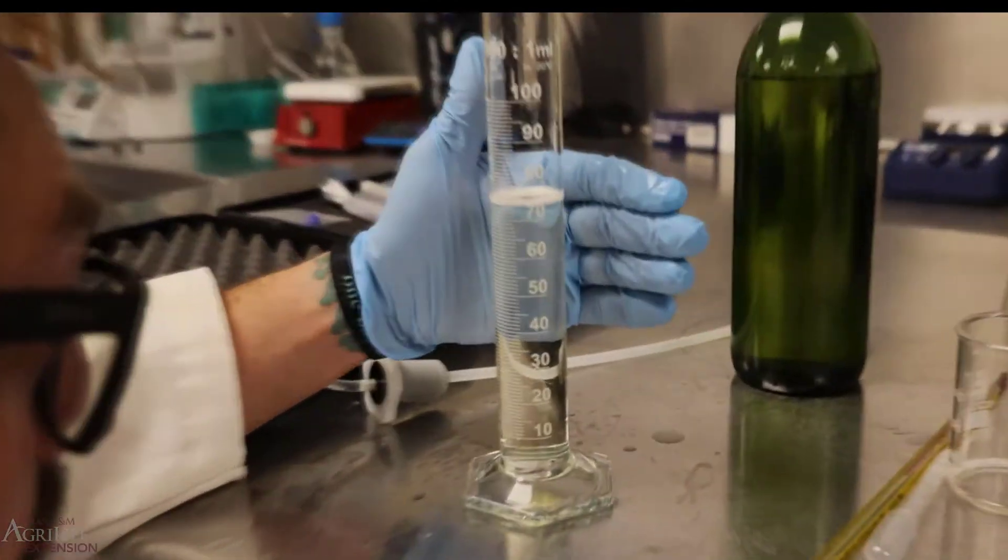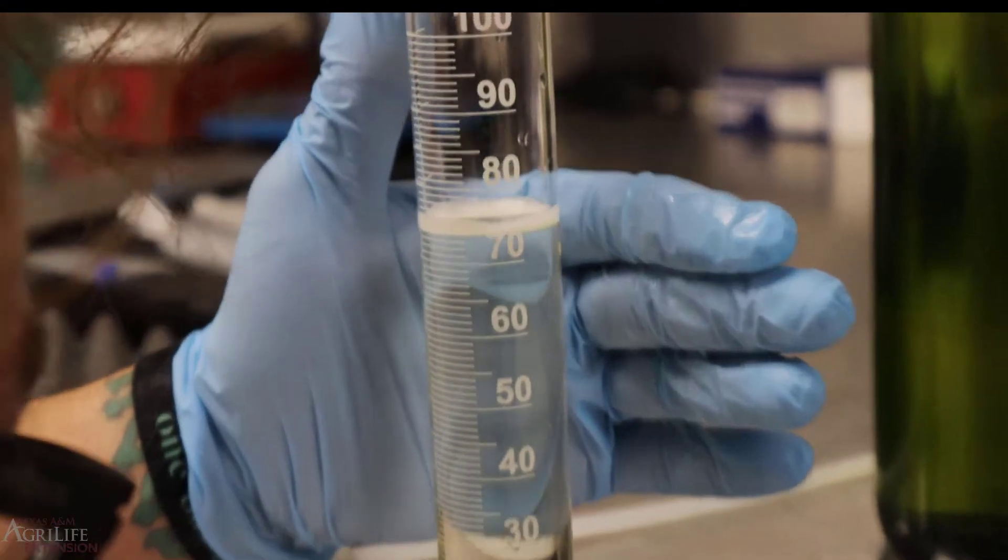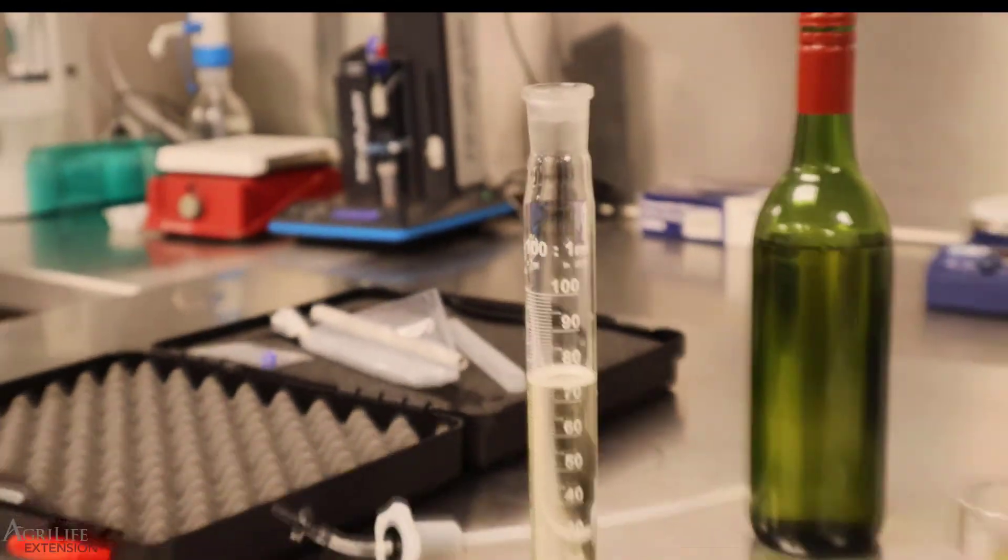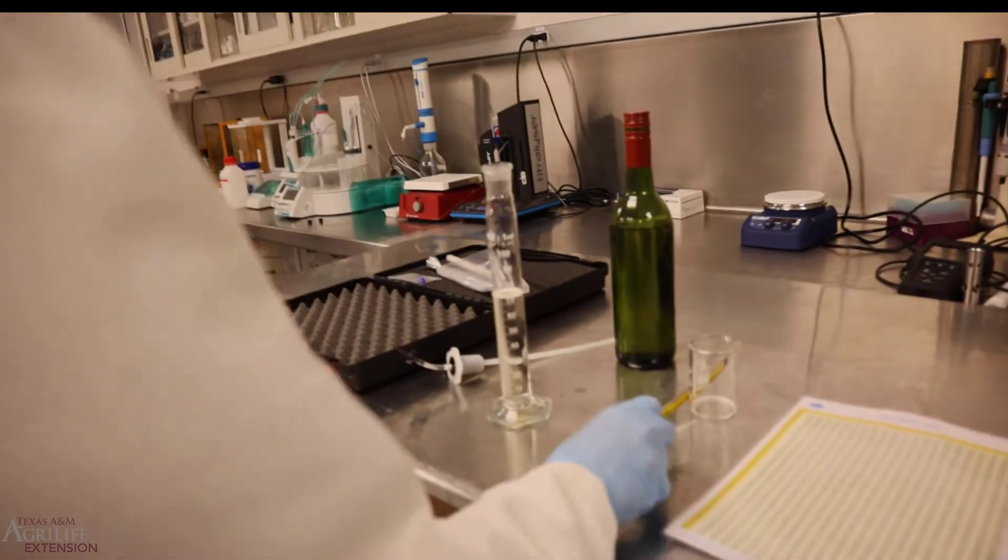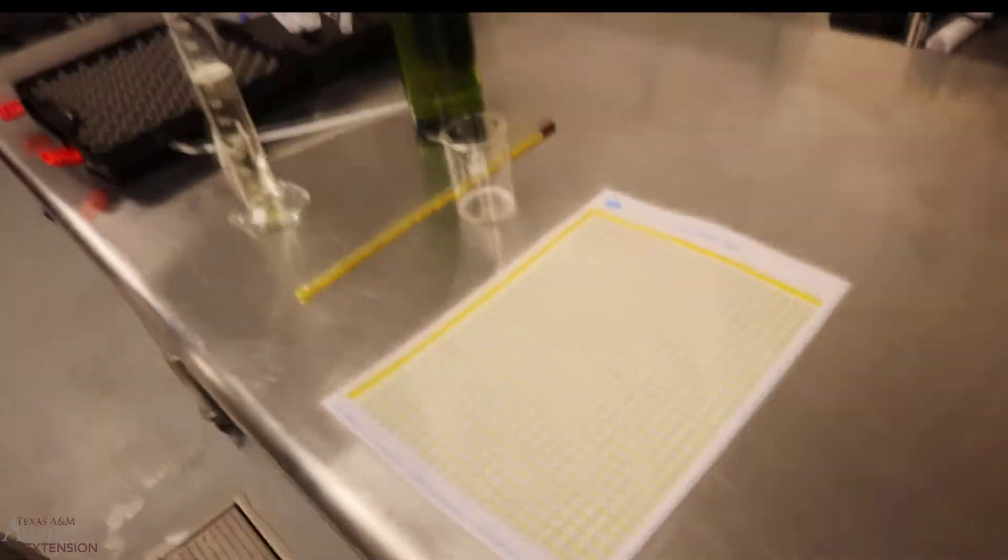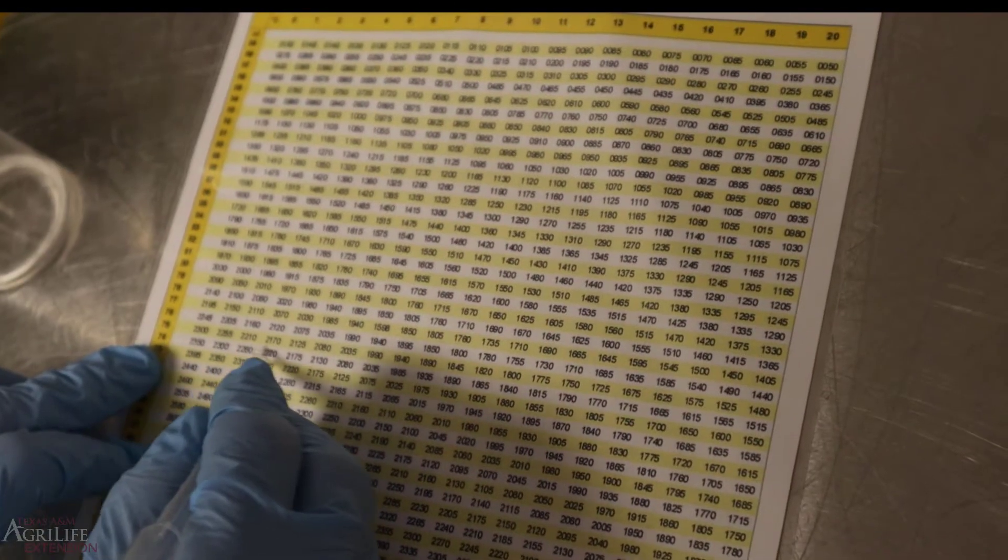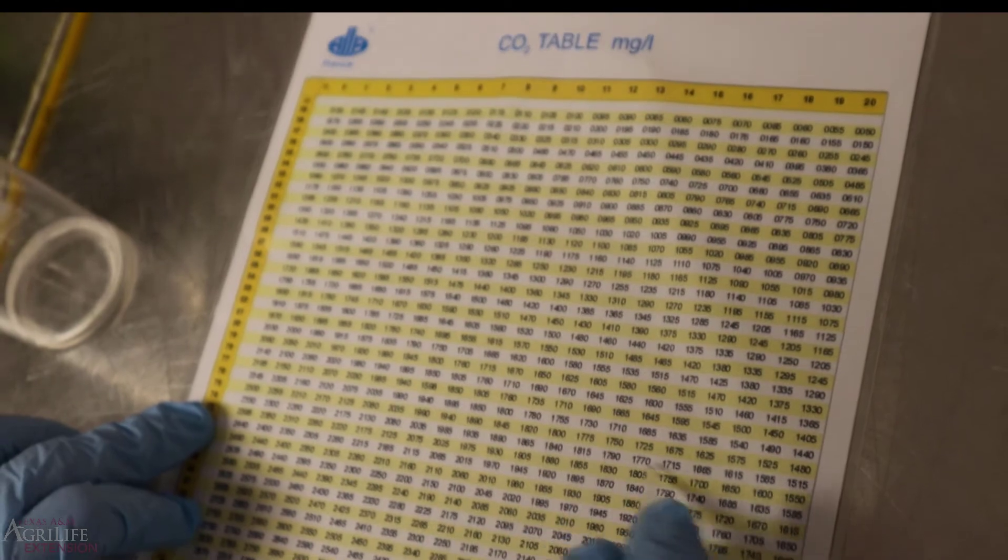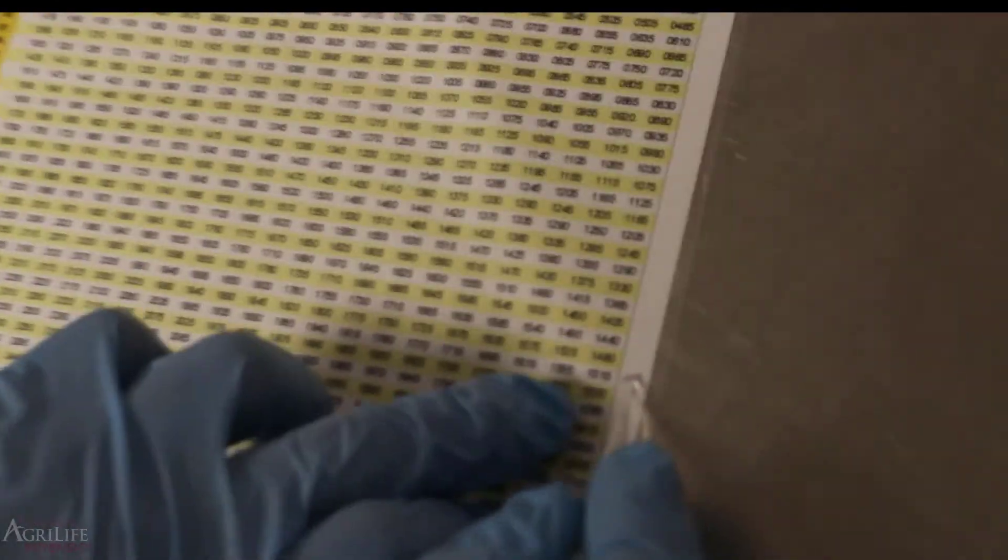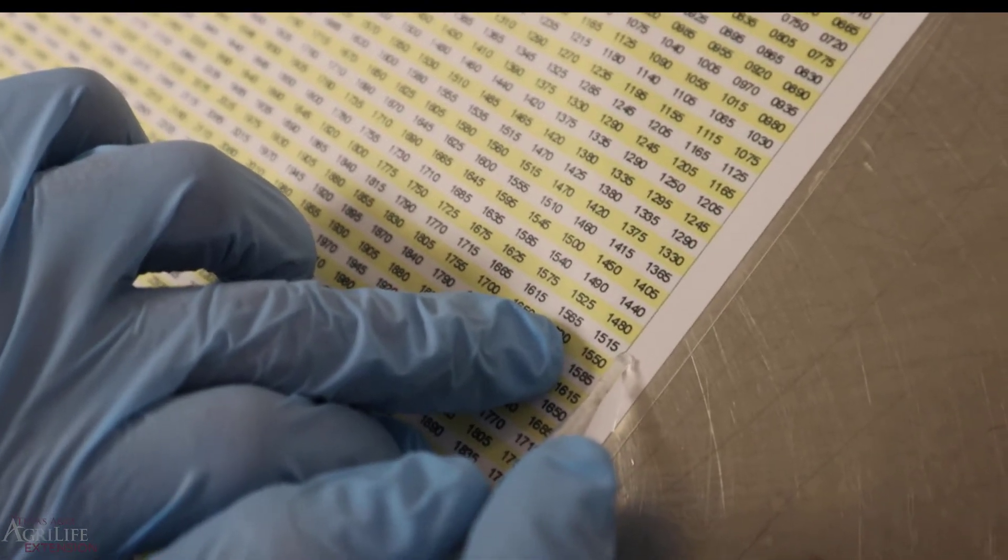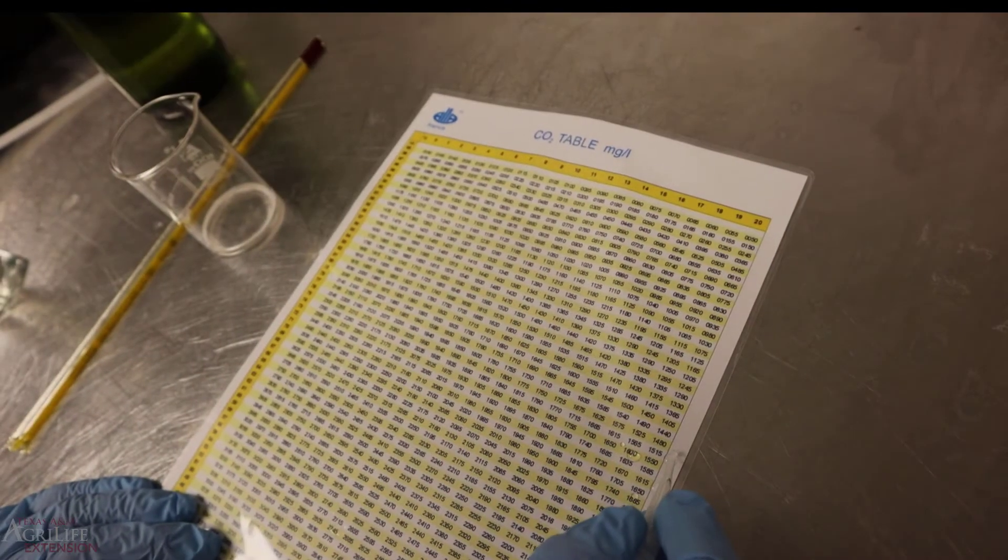And our reading looks to be about 74 mils. So with our temperature of 23 degrees Celsius, 74 mils, we'll come over to our chart. We'll find our mils. 74, 23 degrees. Go over and it's off our chart. So this bottle of wine looks like it is at 1,400 mils of CO2.